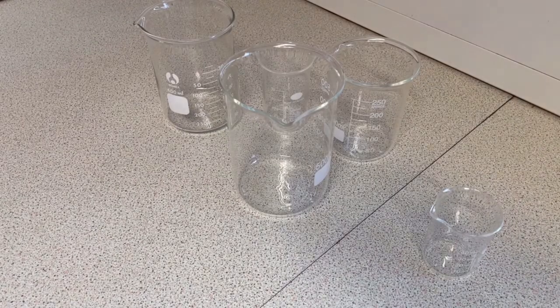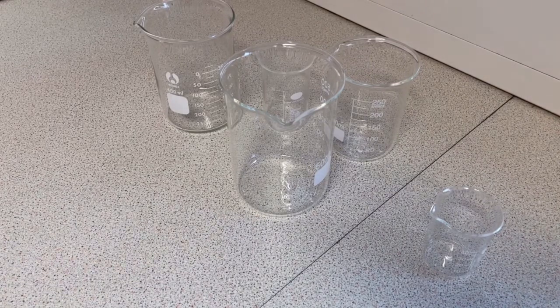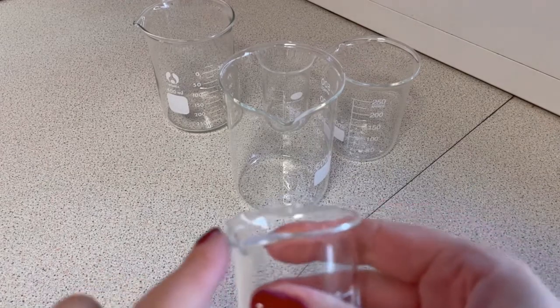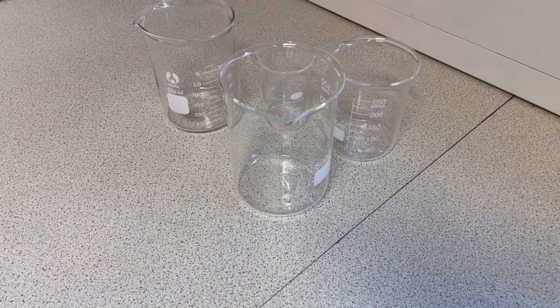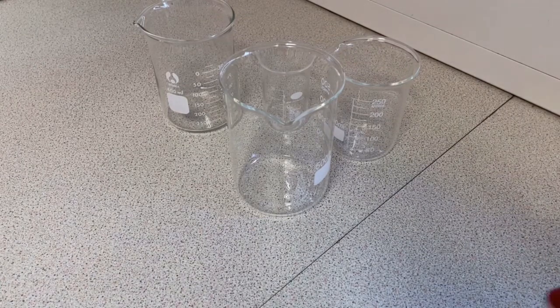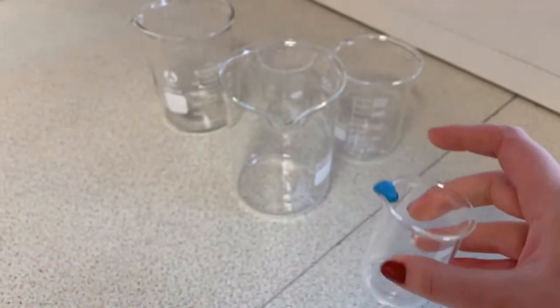This is an investigation to show how changing the amount of oxygen will affect the length of time a fuel will burn for. Now in this investigation I've got a range of different sized beakers. These are going to be placed over a candle and we will time how long it takes for the flame to extinguish. Now in our beakers we do have these lips that are for pouring, so to make sure that this investigation is carried out fairly and there is no additional oxygen getting into the beaker, we are going to block off those lips so that there's no external air getting in to the flame.